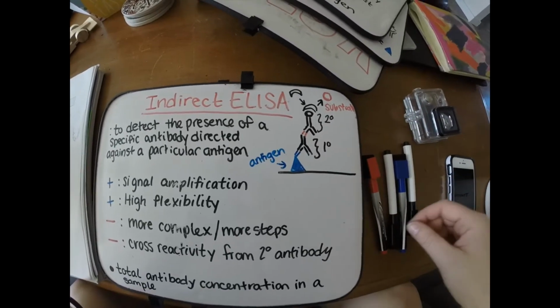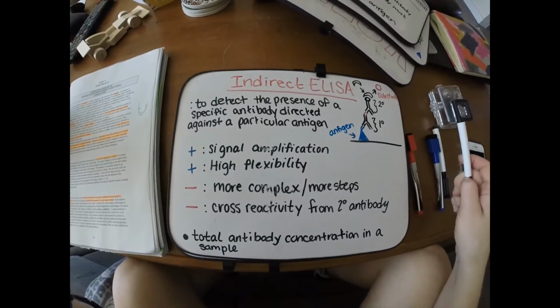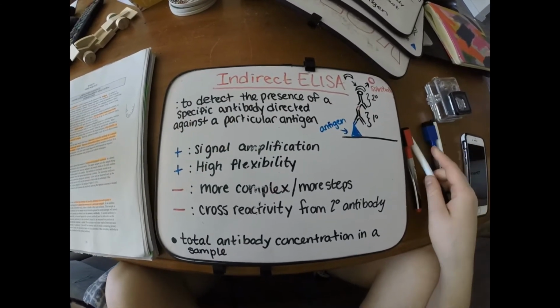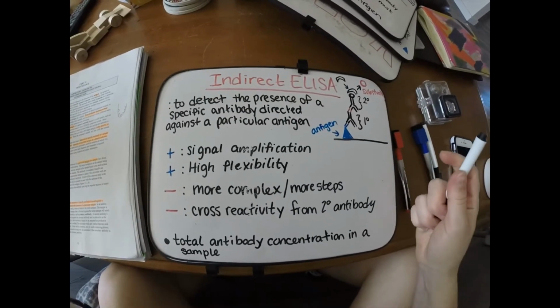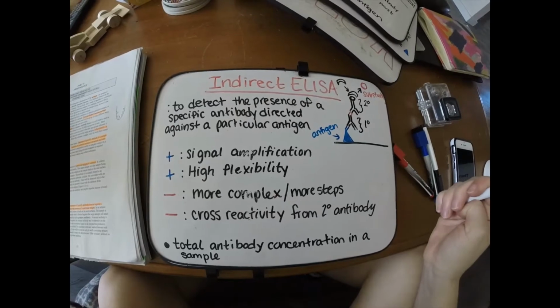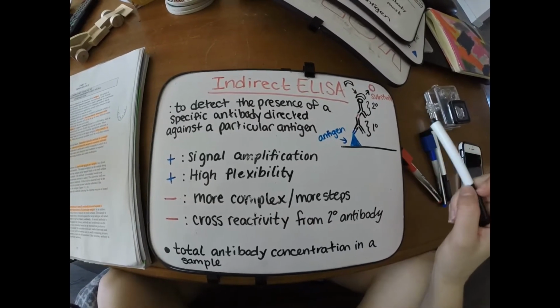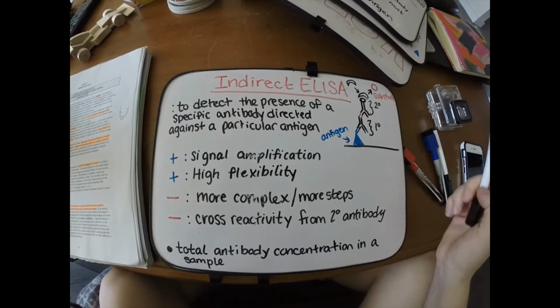So what are the benefits of using this method, or why you would use it? Well, like I said, it kind of goes back to whatever your question is, right? But also, this is a more flexible system, so there's higher flexibility than the direct ELISA.